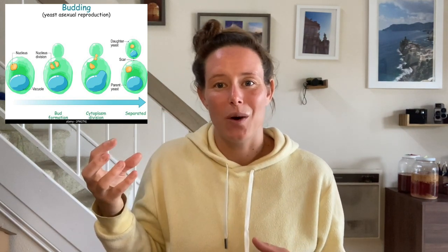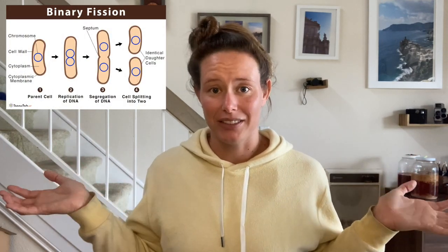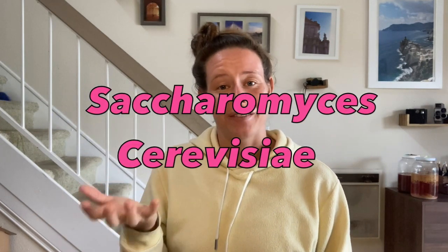And budding is kind of what it sounds like. It's where the parent cell creates a daughter cell and it looks like a little bud that starts to grow off of the cell and gets larger until it becomes its own cell. Binary fission, on the other hand, is when the parent cell just splits itself in half. There you go. So the most popular fission yeast is Schizosaccharomyces pombe, and the most popular budding yeast, or the most popular yeast, is Saccharomyces cerevisiae.